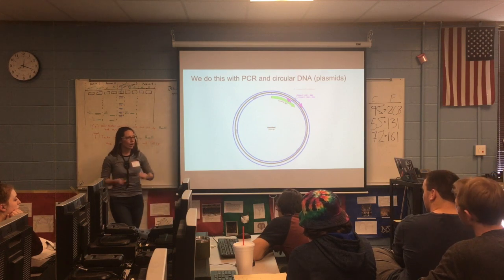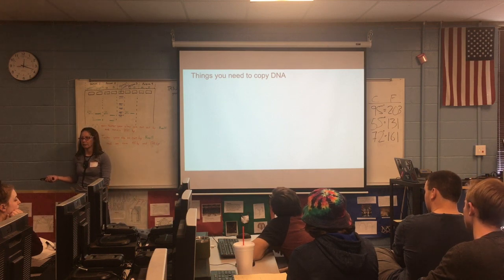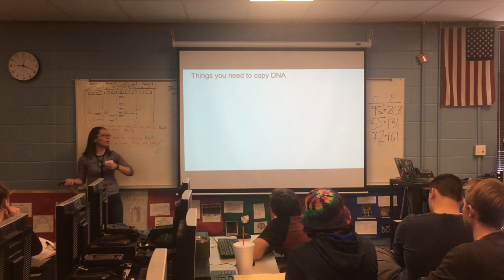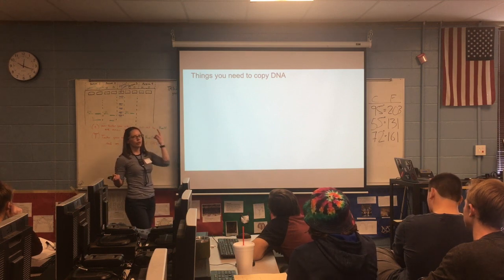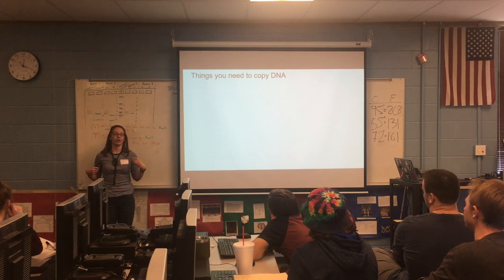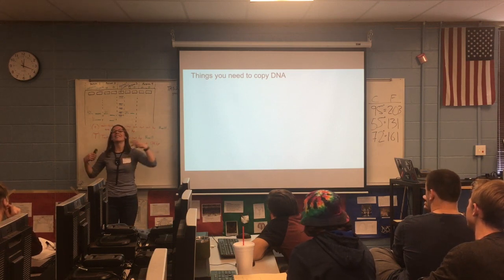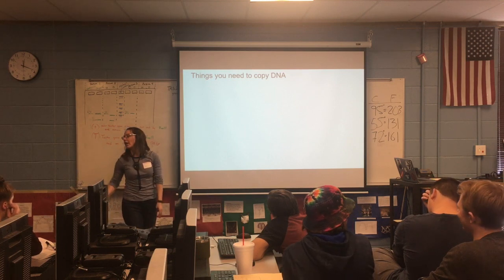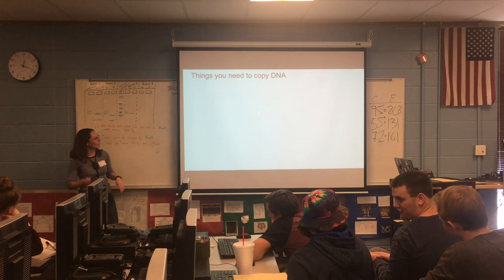All right, so quick reminder, what do you need to copy DNA? Primers. You need primers. What else do you need? Polymerase. Polymerase, what else do you need? Nucleotides. Nucleotides, and what kind of DNA? Your desired gene. Well, not my DNA, because I don't have GFP in me. The desired gene, the template DNA, what you want to start with, and then you need a thermocycler to raise and lower that temperature over and over and over again.